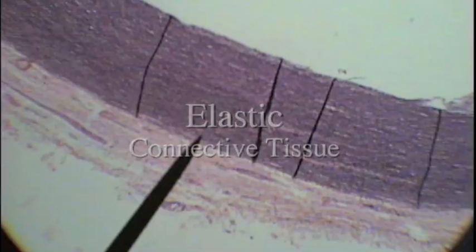Connective tissue known as elastic connective tissue. There are many elastic fibers in this connective tissue. Although we can't see them at this power, at scanning power, we will go up a power and take a look at those elastic fibers.